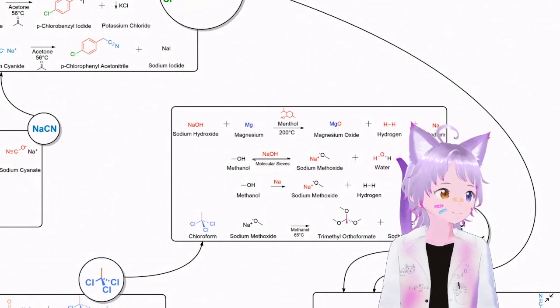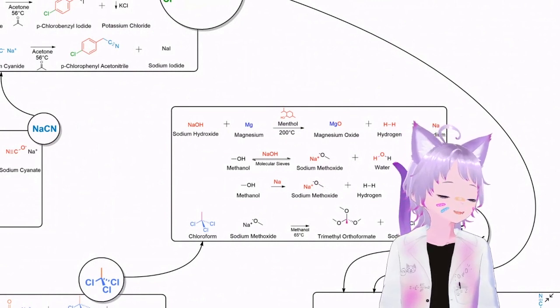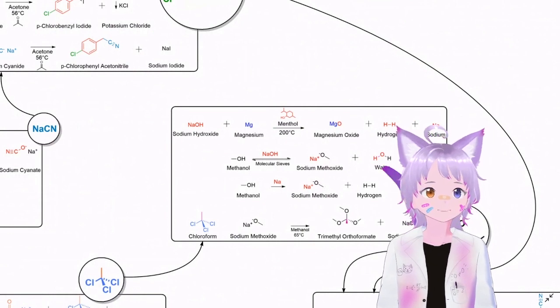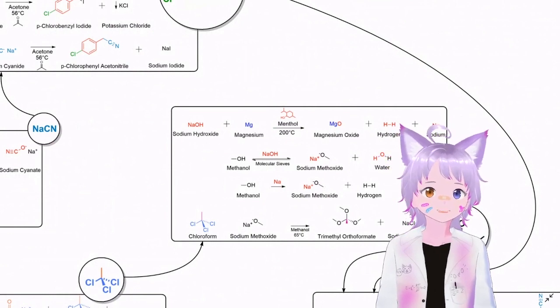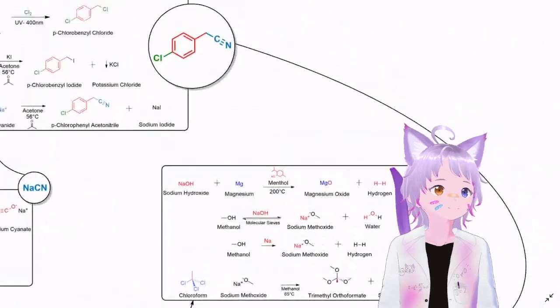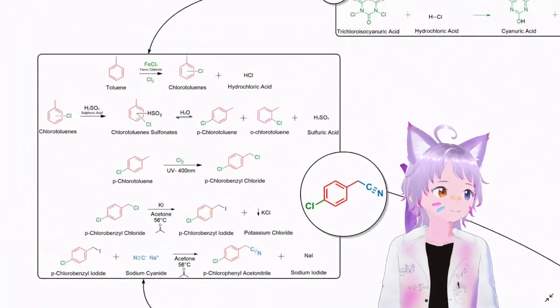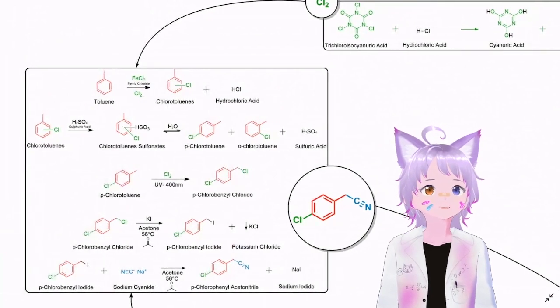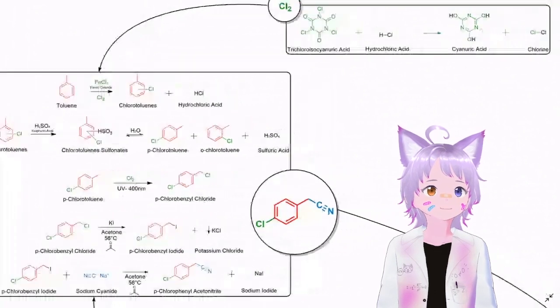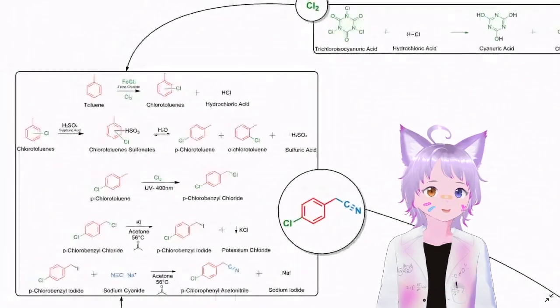In Nurdrage's video, he said that aluminum can be used for drying, right? But it does not participate in the reaction, if you remember. What you can do is get the furnace, melt a magnesium and aluminum alloy, and just break it because it's super brittle. You can grind the magnesium alloy down with an ordinary mortar and pestle to a fine powder. Then the aluminum itself won't really partake, but you have to make sure to add the minimal amount.